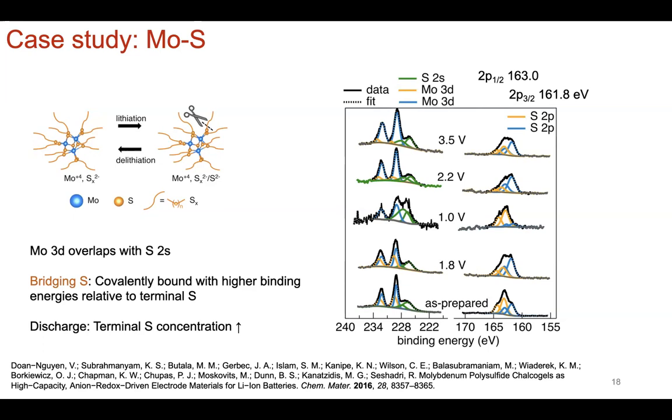Sometimes when you do that, though, you're going to interact with your sample, and you're going to cause reduction in other species that will form as a result of the processing. And so for this publication, we left it as is and just reported this is the data, but the trends hold. Now, interestingly, what's happening with the molybdenum side is that nothing is changing. It's quirky to publish and say nothing is changing, or nothing significant is changing.